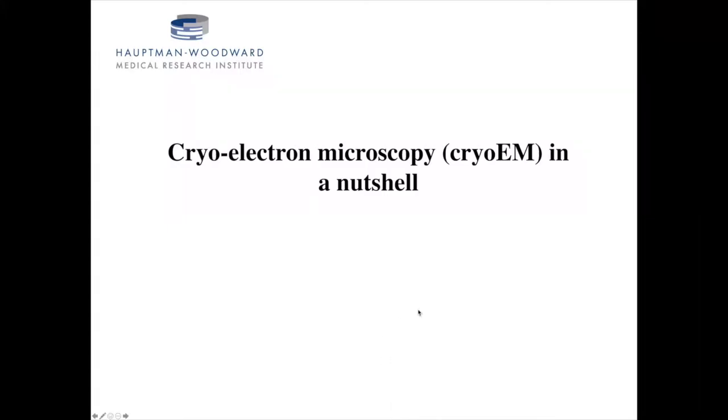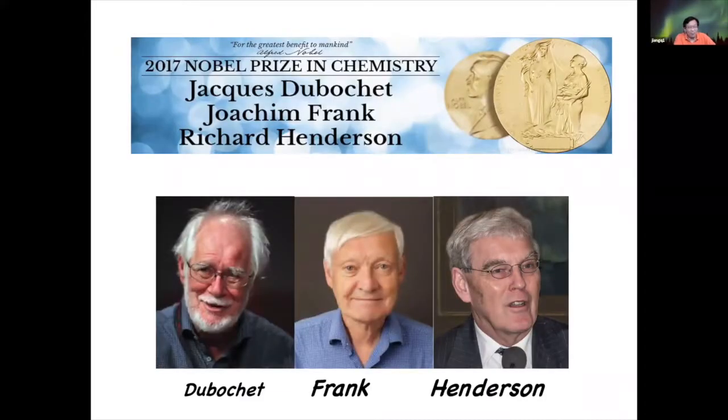First, I will give you a brief introduction about cryo-electron microscopy, or cryo-EM. Cryo-EM has been a technology for structural biology since the 1960s, actually. The principle for three-dimensional reconstruction of electron microscopy images was proposed quite long ago.